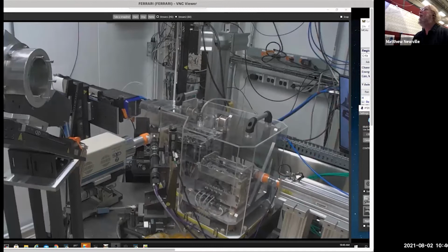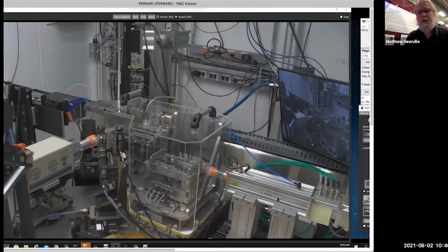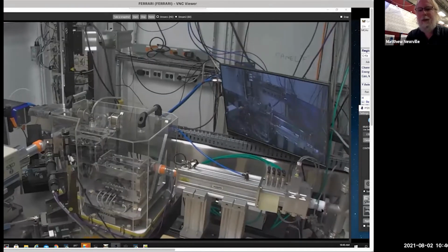I didn't mention this beam path from all the way upstream through the mirrors and the ion chamber. There's a window on the end just downstream of here, a thin Kapton window, thin plastic, right here, where you can see some white electrical tape. There's a thin Kapton window there, and then the rest of this is in helium. At our beamline, we go down to the sulfur K edge, and as you know, mu is strongly energy-dependent, E to the minus 3. So this is all in helium so that we can get down to sulfur and get enough X-rays. In fact, the plastic windows that we have are a significant fraction of the absorption for sulfur X-rays. But we can do sulfur. We regularly do sulfur at this moment. But this is all in helium.